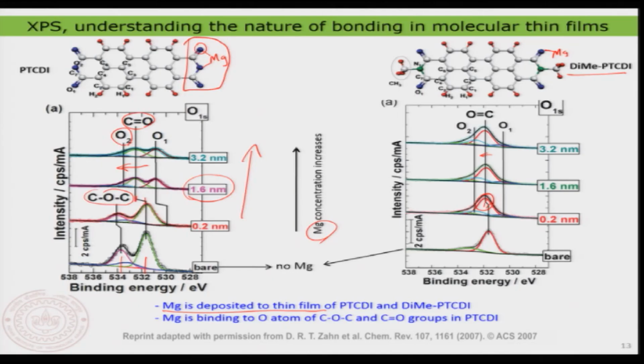So, that means as a combination of UPS and XPS, you can understand the entire valence band and also the core band. Yeah? The valence band is important for us to understand, because those are the electrons responsible for the reactivity of a molecule, or when it comes to charge transport, those are the electrons that are going to be transported, because they have the lower binding energy. But the electrons that are lying deep inside the core band also have nice chemical information about how the interaction between the molecules and the interaction with the surface is going on. Yeah. So, with XPS we can therefore, by looking at the oxidation state, clearly understand the interface and also the chemical structure. So, that is the thing about the photoelectron spectroscopy.